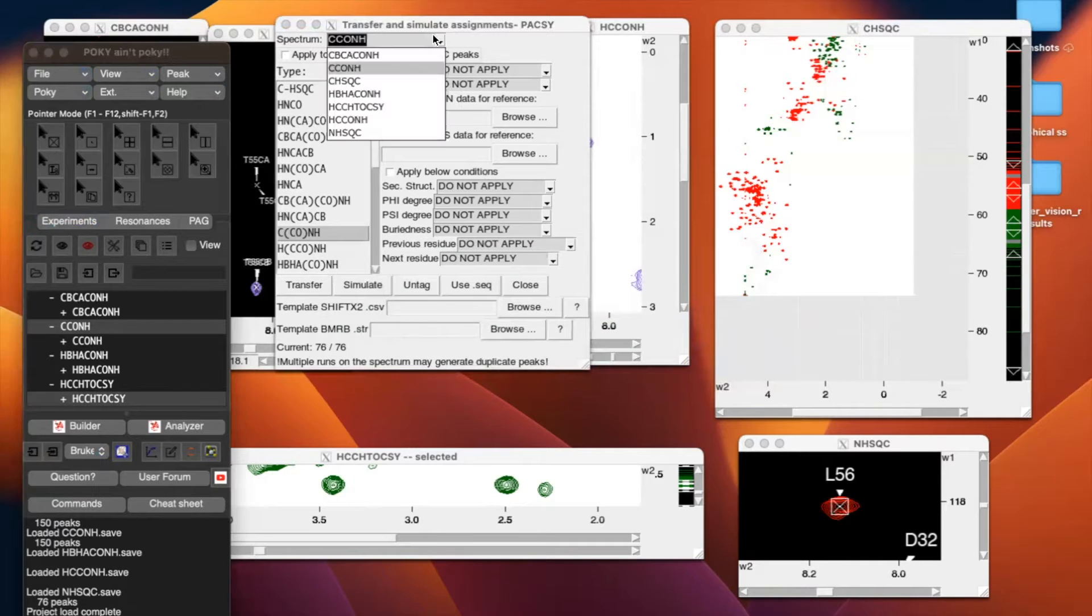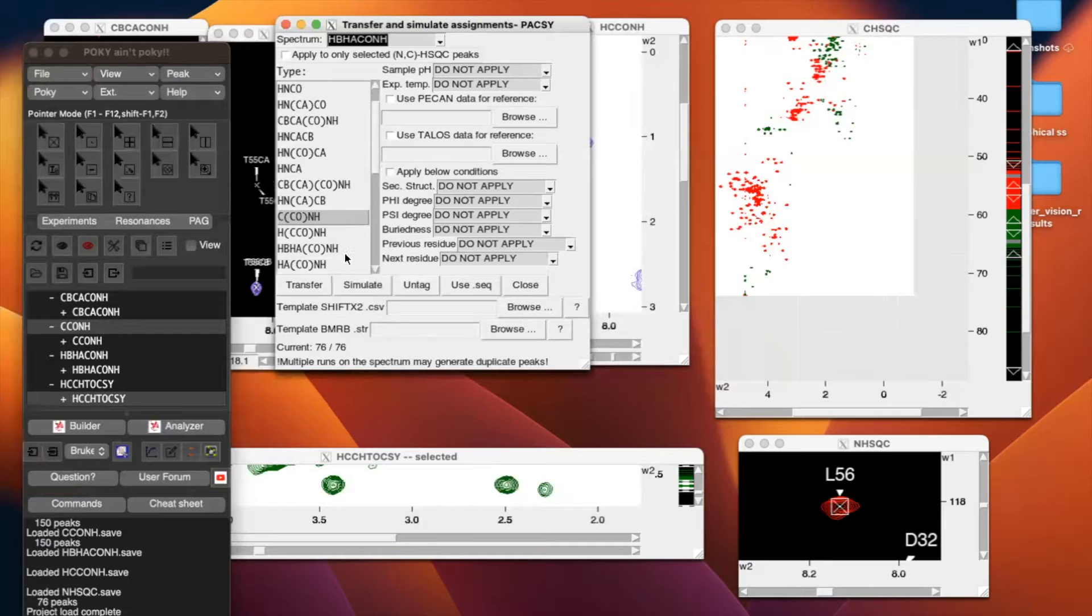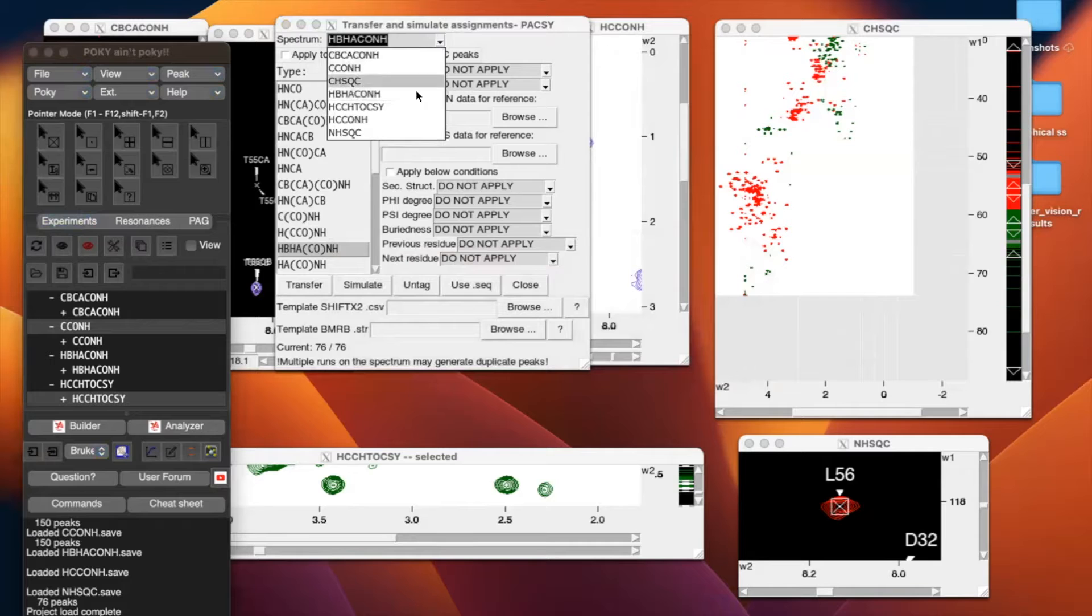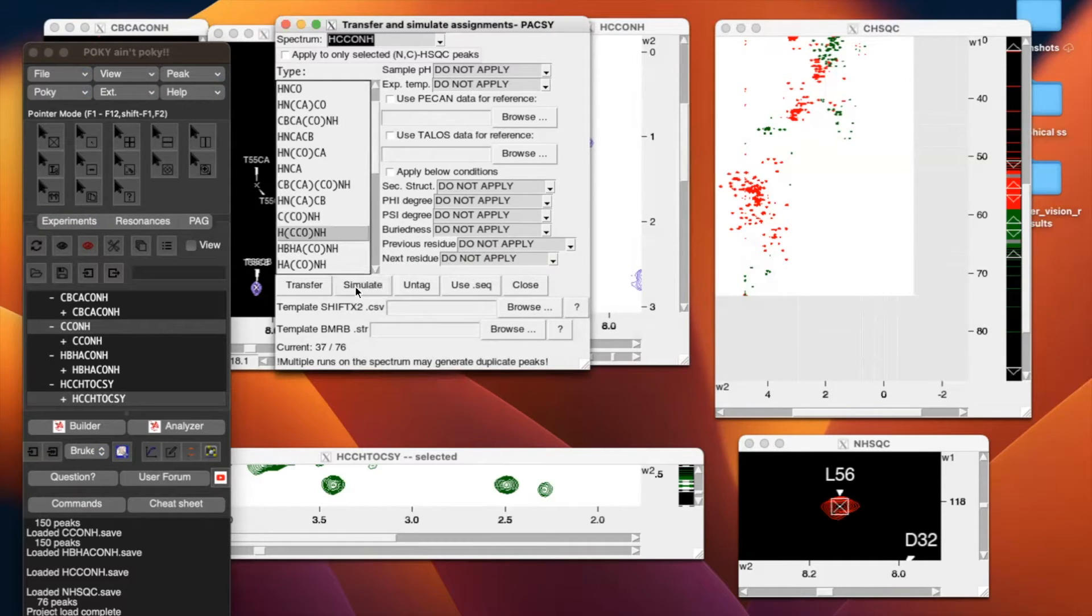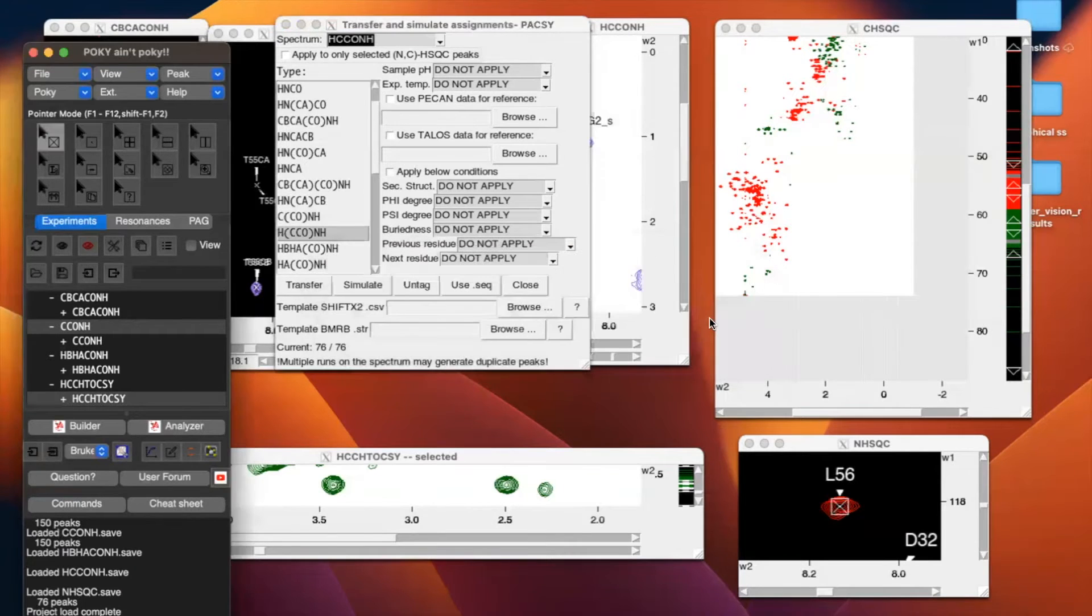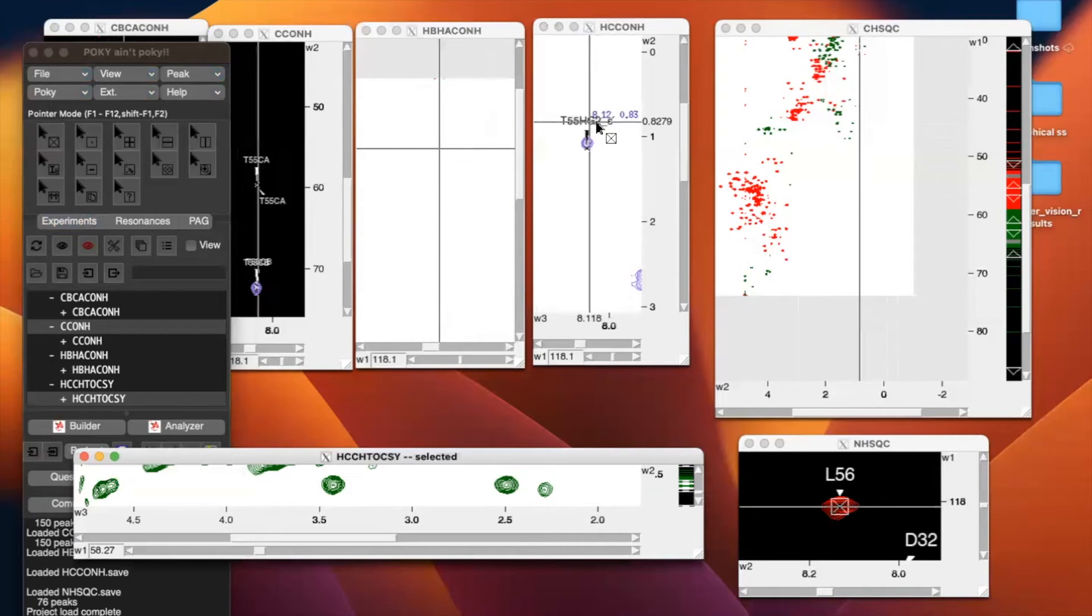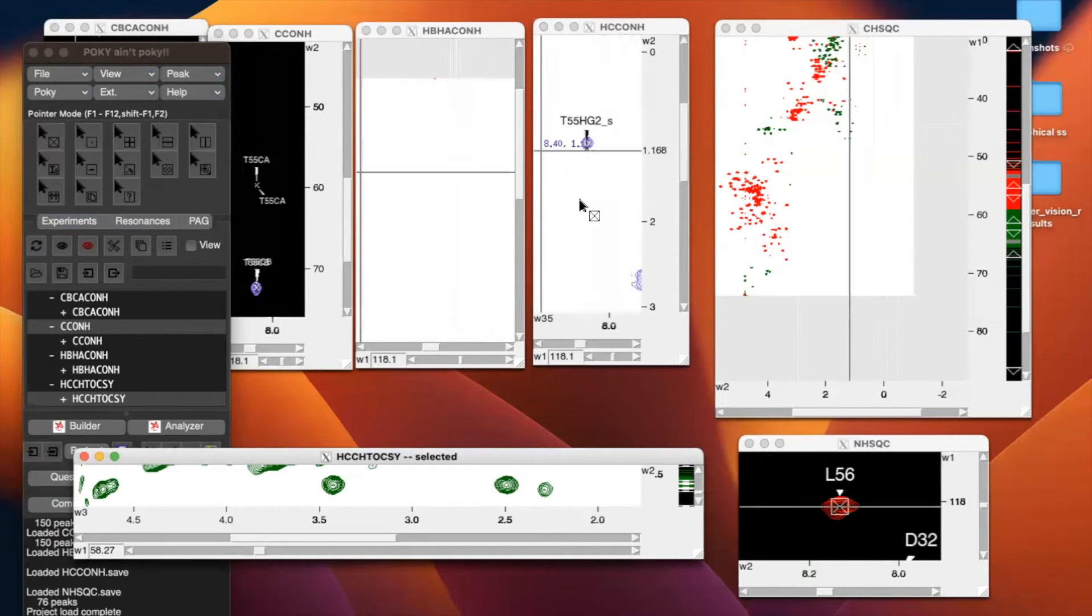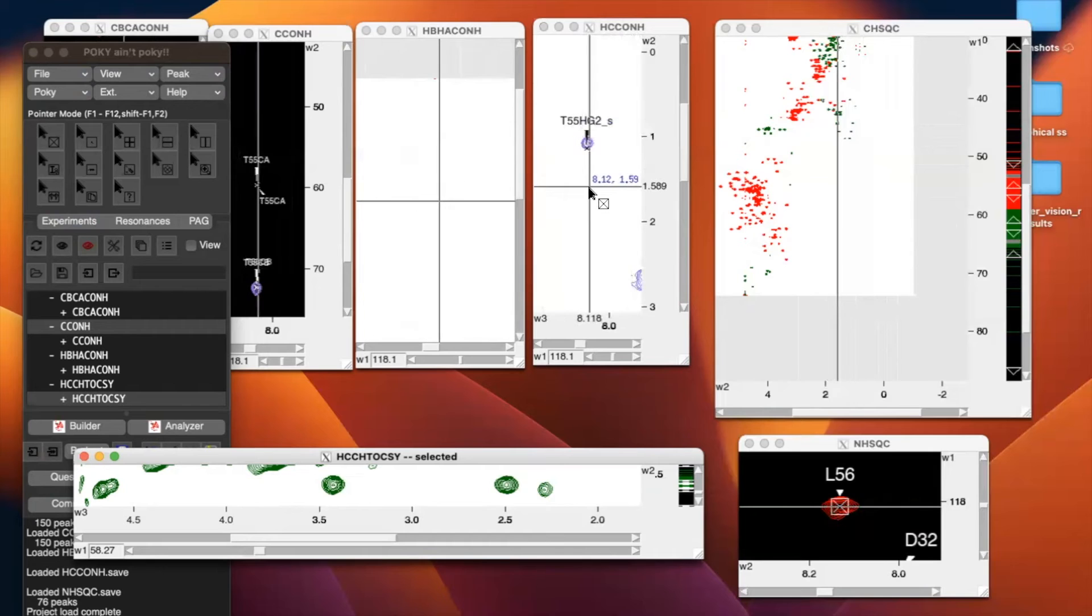I'm going to do the same thing for HBHA-CONH. In this case, carbon alpha and carbon beta are transferred, but other assignments are simulated. So you can see here, we have underscore S, which indicates that this was a simulated assignment.